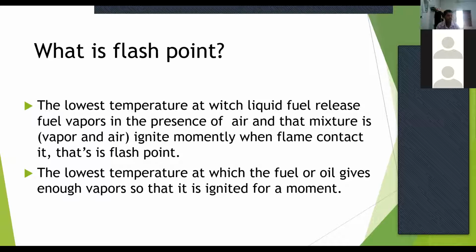Flash point is the lowest temperature at which a liquid fuel releases fuel vapor. When we increase the temperature of a liquid, say water, there will be water vapor in the atmosphere above that liquid.